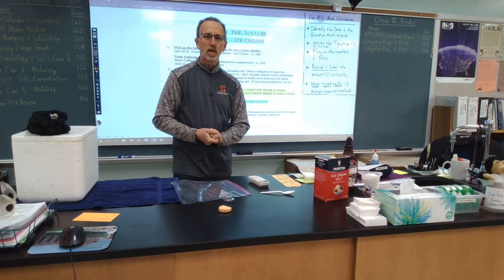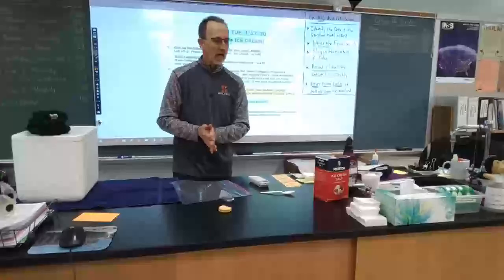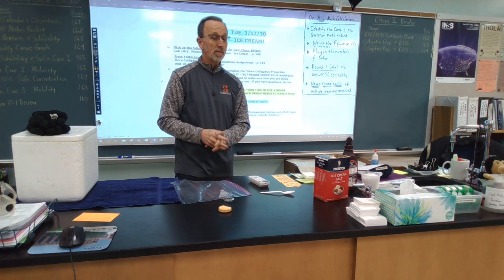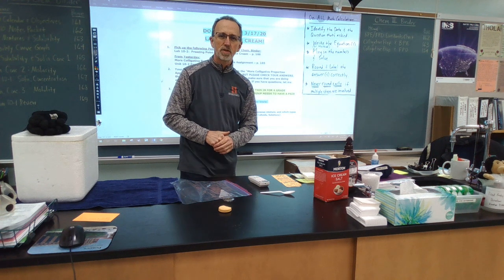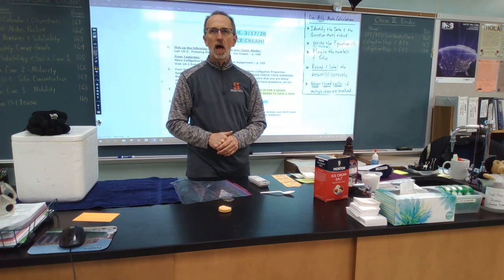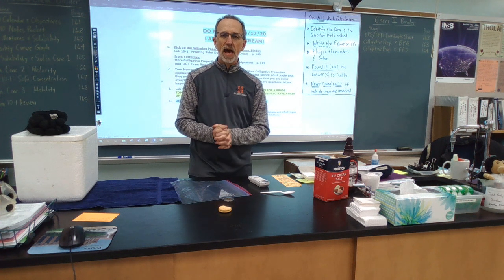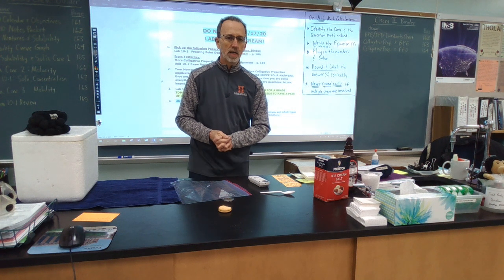Today I'm going to go through with you one of my absolute favorite labs of the year, and that is the one over freezing point depression, but more importantly, specifically in regards to making ice cream. This is a lab you'll look forward to doing when you come back, so hopefully that won't be too awfully long from now.